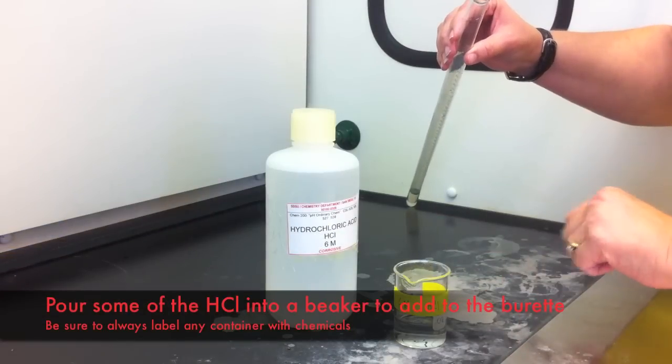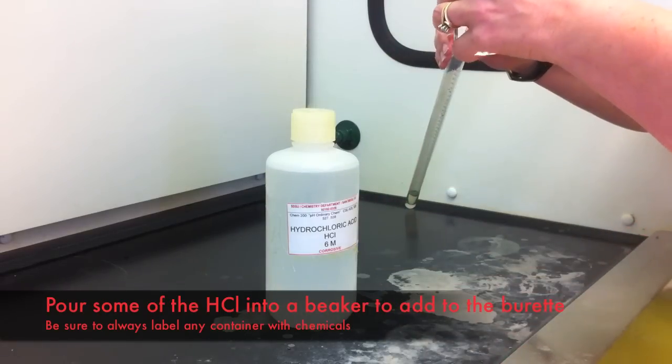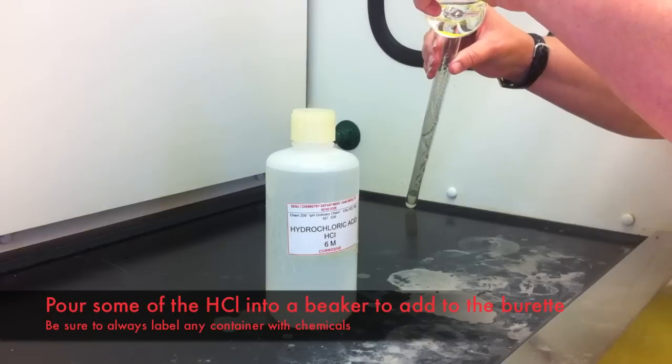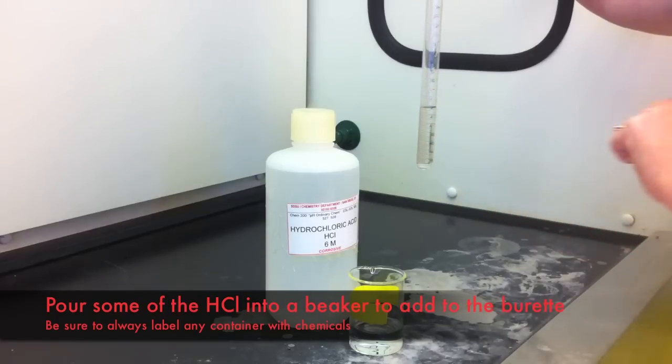Once you've prepared the magnesium ribbon in the copper wire cage, you'll need to collect some hydrochloric acid and fill a portion of that into your burette. You'll only require about 10 to 15 milliliters of hydrochloric acid, so use a beaker to pour it into the burette.